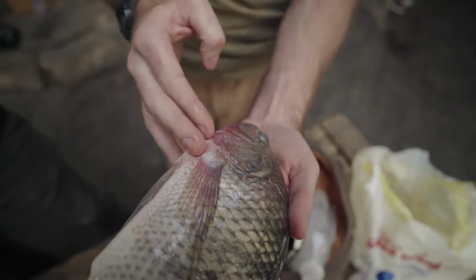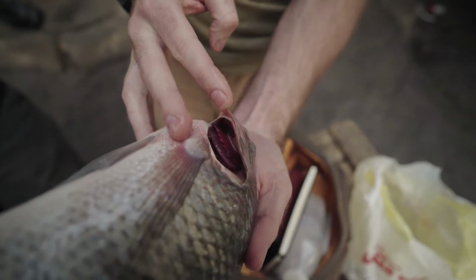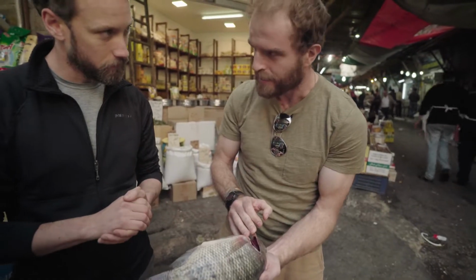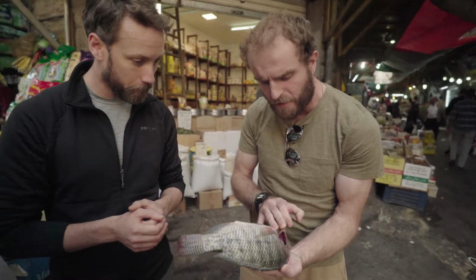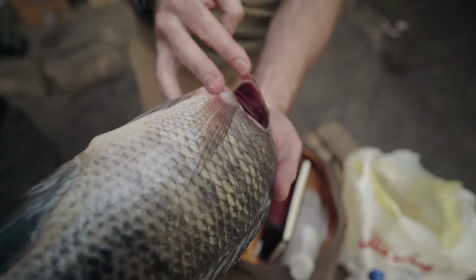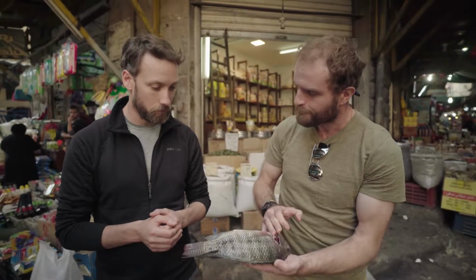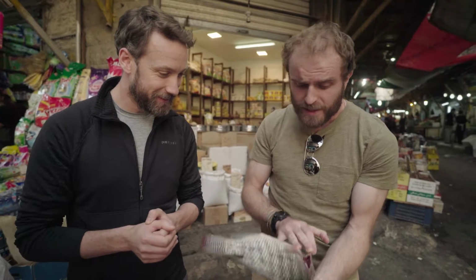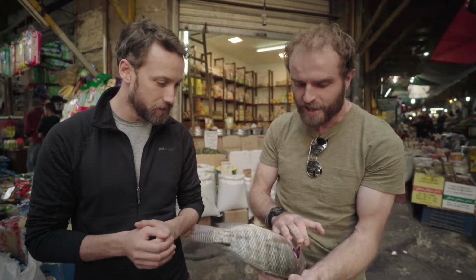Fish breathe water. They breathe the water through their mouth, and it comes out their gills. So the gills are like their lungs. Exactly. They're a very, very fine structure, and as the water passes over them, the oxygen is taken from that water. If you look at the colour of these gills, they're bright red, just like our blood is bright red. And that tells you that there's an awful lot of iron in those gills, because iron is what binds the oxygen in our blood. So it says it's fresh. It also says this bit of the fish is something to do with oxygen.